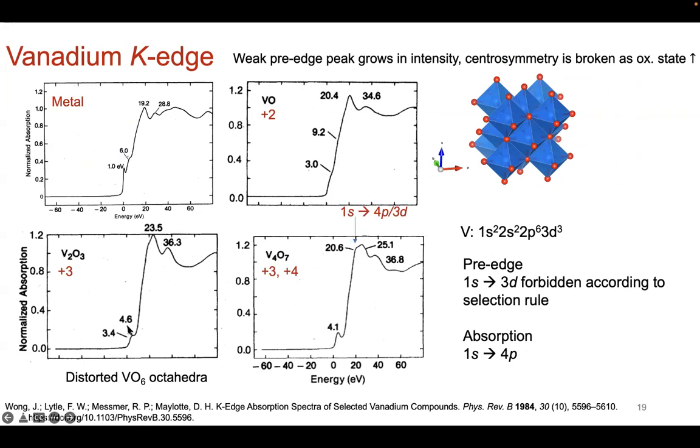These two peaks have to do with the crystal field splitting. So in an octahedral environment, you have the t2g. Flashback to lecture 3, right? You have the t2g and the eg. But then in the t2g orbital, with the Jahn-Teller distortion, you have the 3d xy, yz, and xz.